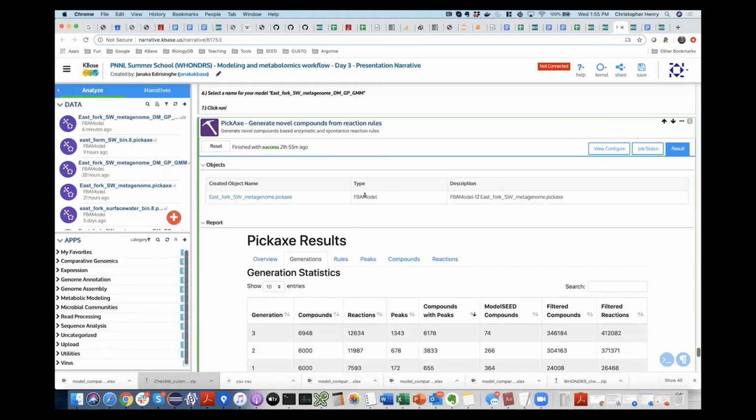We're about to enter a new age of metabolomics, because of a combination of machine learning, being able to annotate metabolomics data better, and improved instrumentation. I talked about how they're working on adding MSMS to FTICR, and the non-FTICR machines, Orbitrap and whatnot, are getting better too.